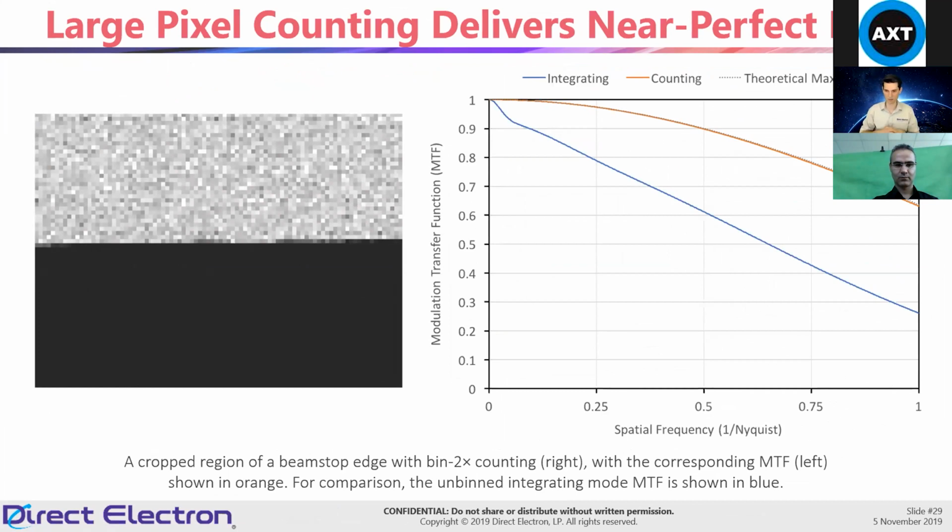And pretty much nobody else does this because typically people will say binning is bad. That is true if you're doing software binning because you can have aliasing artifacts. But if you do hardware binning, when it's all on the sensor, all in the pixels, there's no extra noise added to it. There's no readout event changes. It's basically the 4 pixels are summed up into a single pixel.